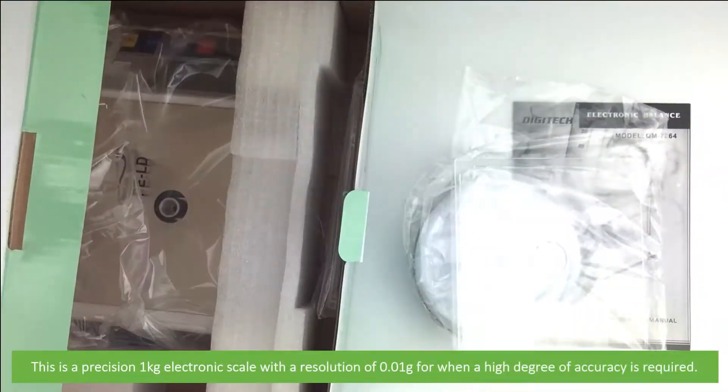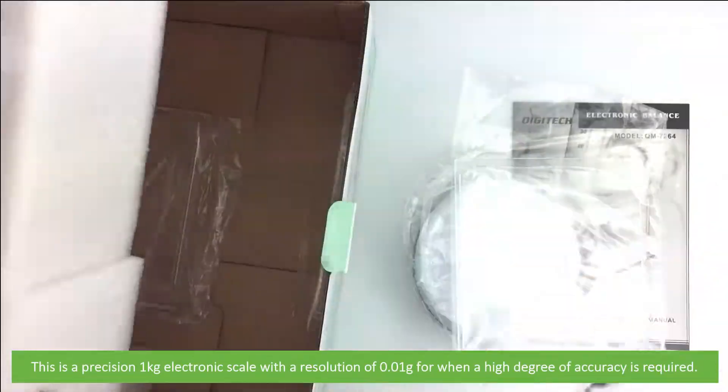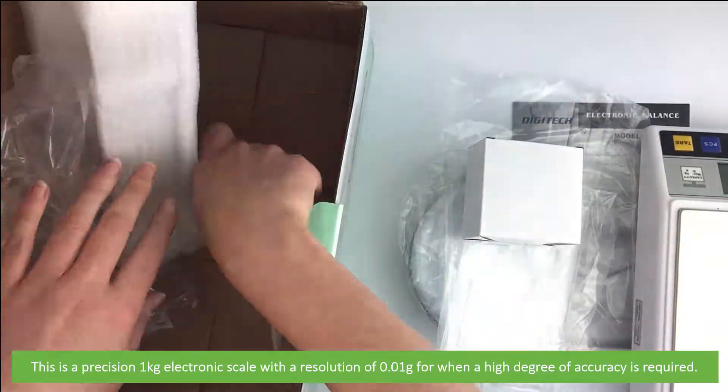This is a precision 1 kilogram electronic scale with a resolution of 0.01 grams for when a high degree of accuracy is required.